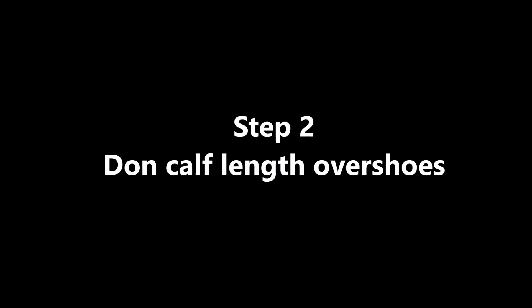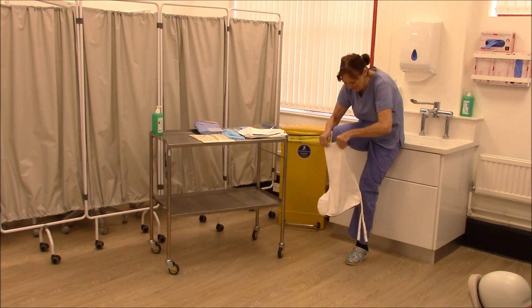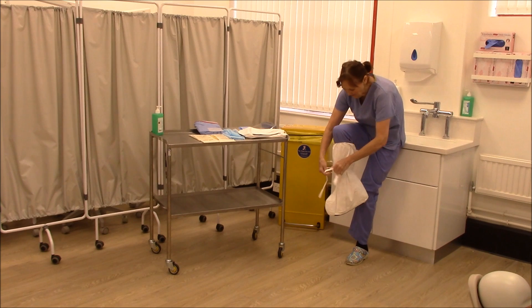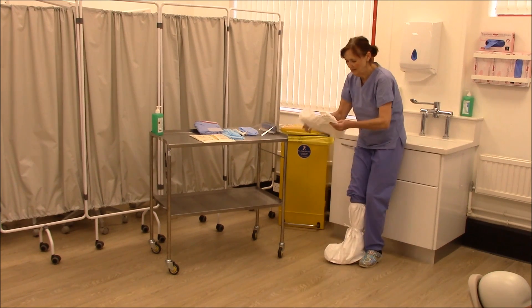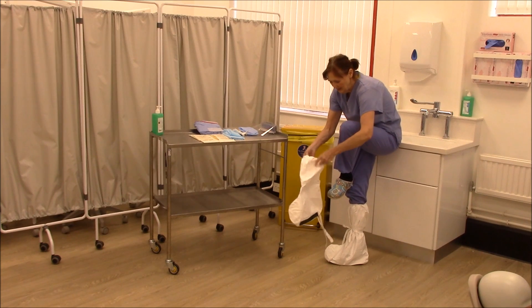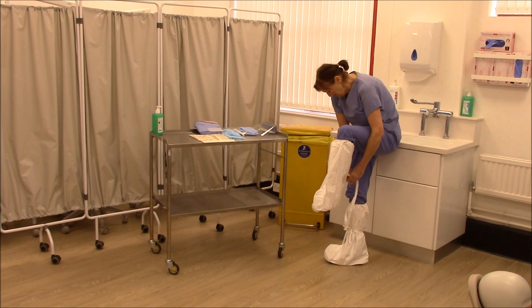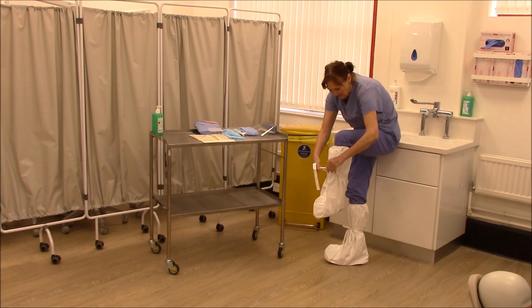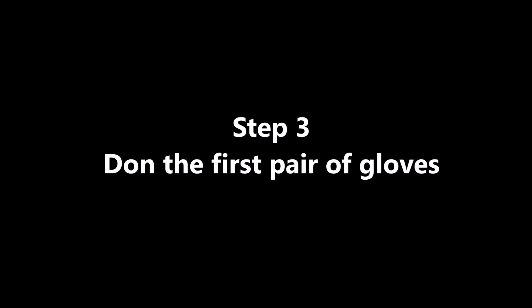Don calf length overshoes. Don the first pair of gloves.